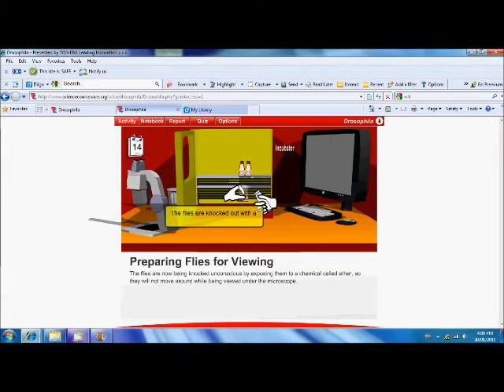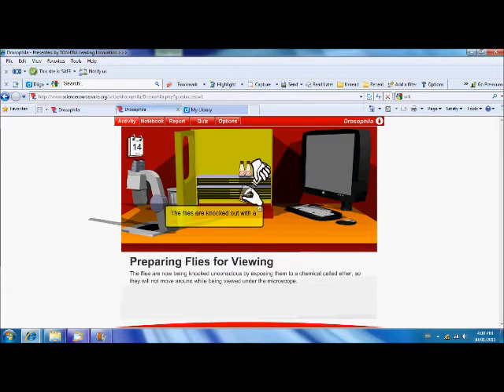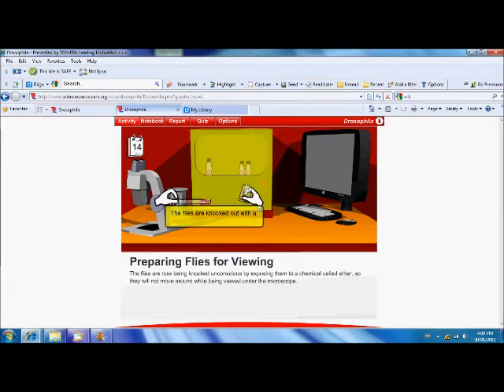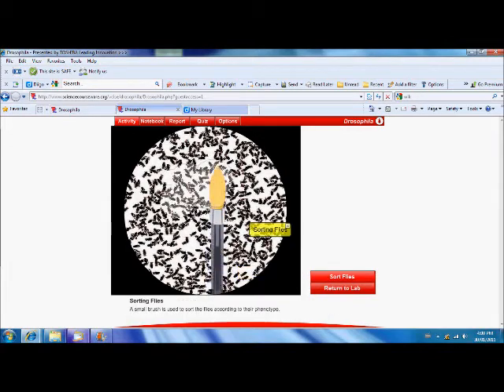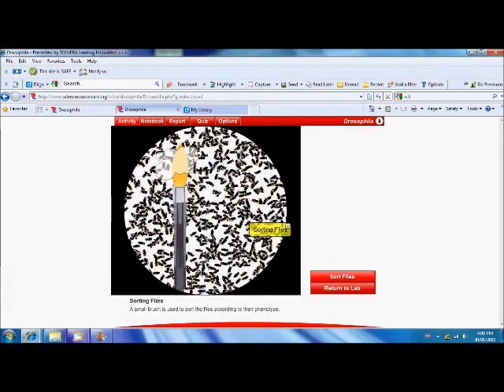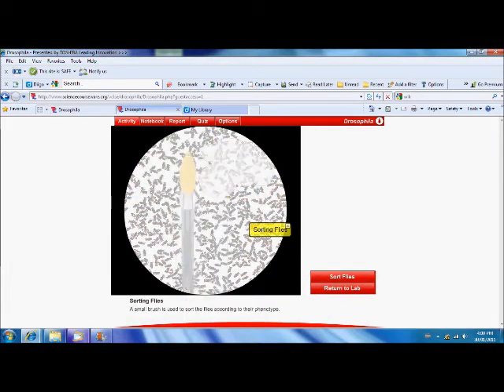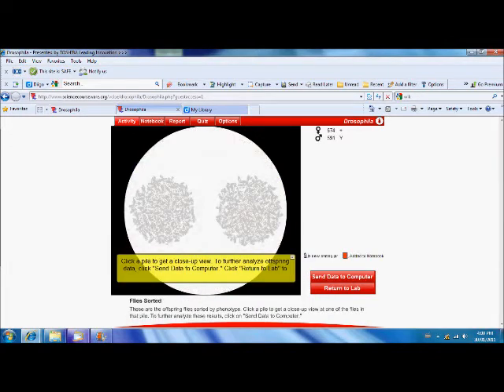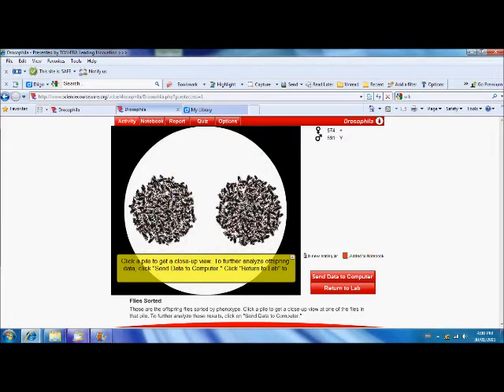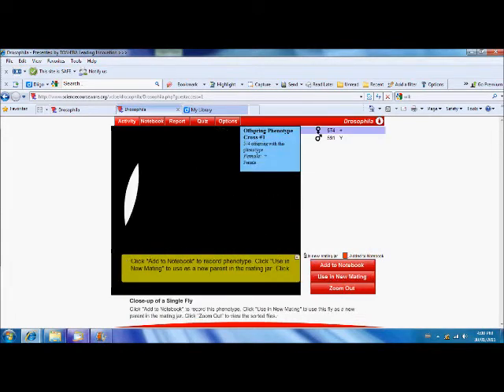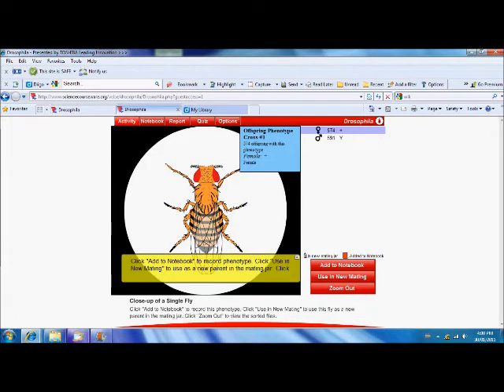Okay, there we go. Click. And now we're going to look at our flies under a microscope. Here we go. Let's sort our flies. Our flies are sorted into males and females. All of our females are wild type. Remember, they were yellow before. So, let's add those to our notebook.